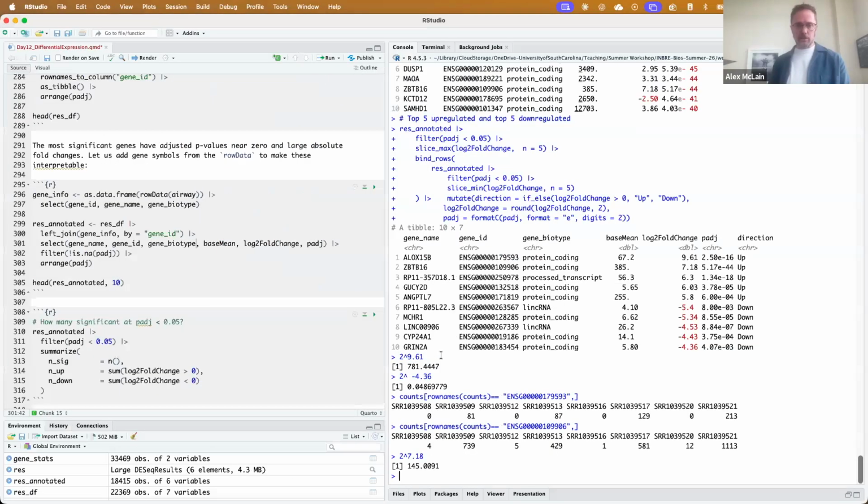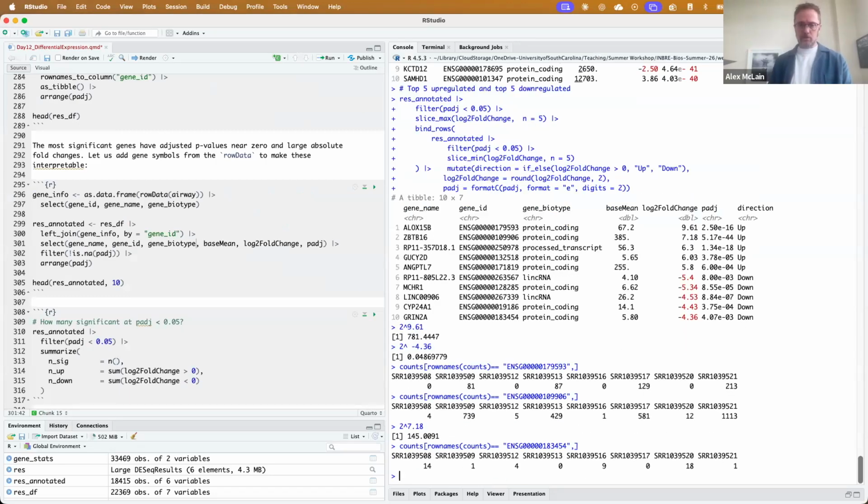And let's take a look at some of the down-regulated ones, I guess, just to be complete. Okay, so here's a situation where the untreated have a larger mean than the treated. Low counts here again. So here the numerator, the treated, have only 2 non-zero reads.